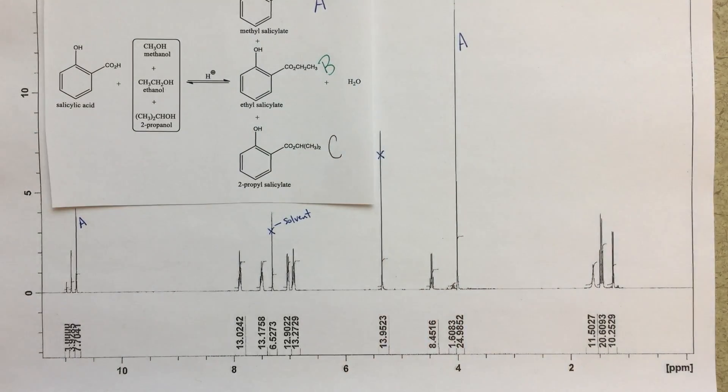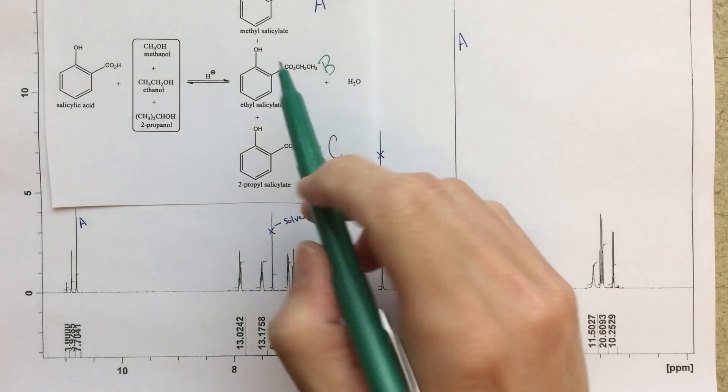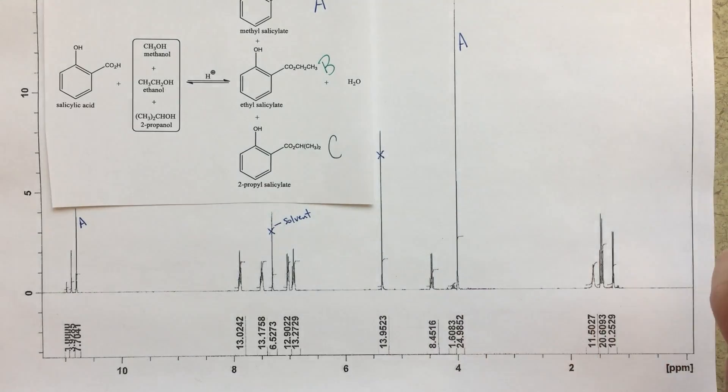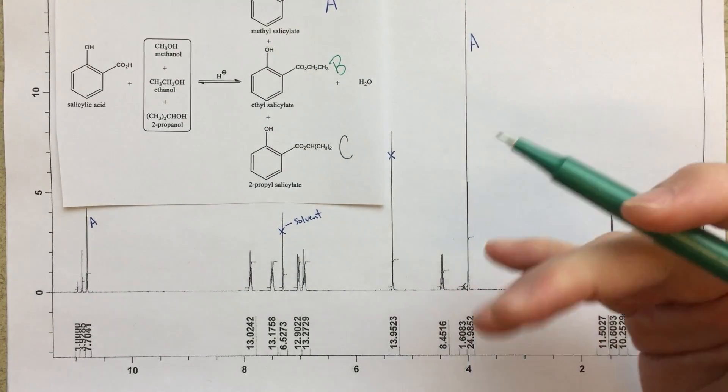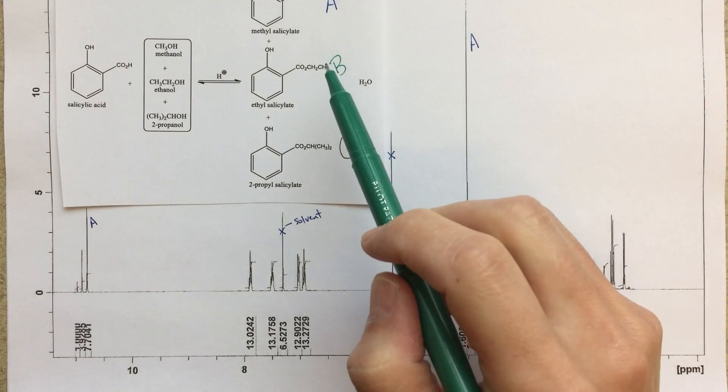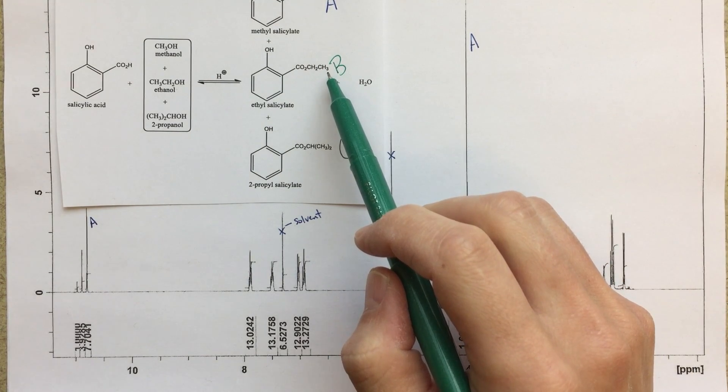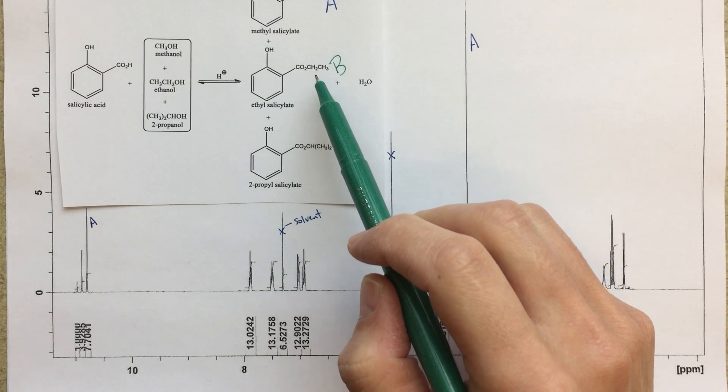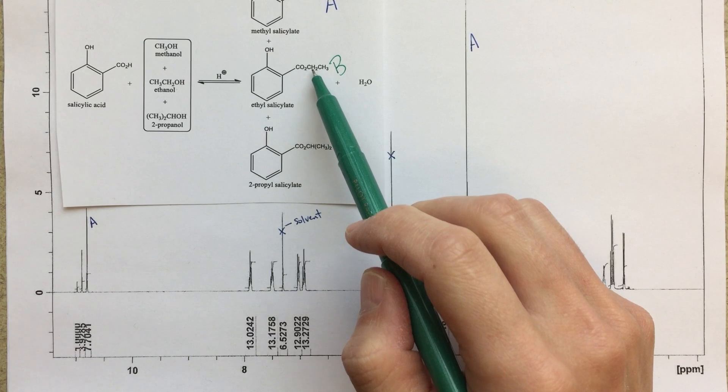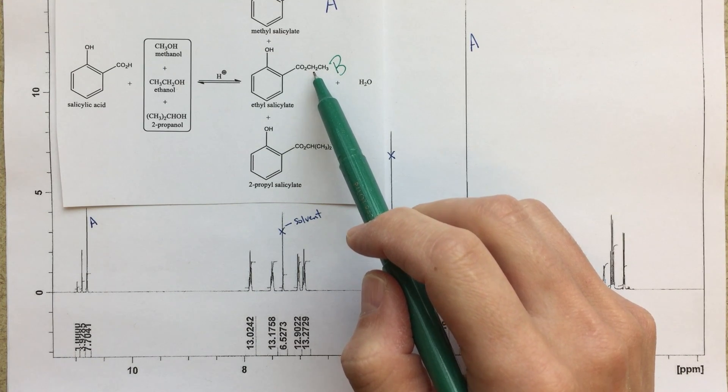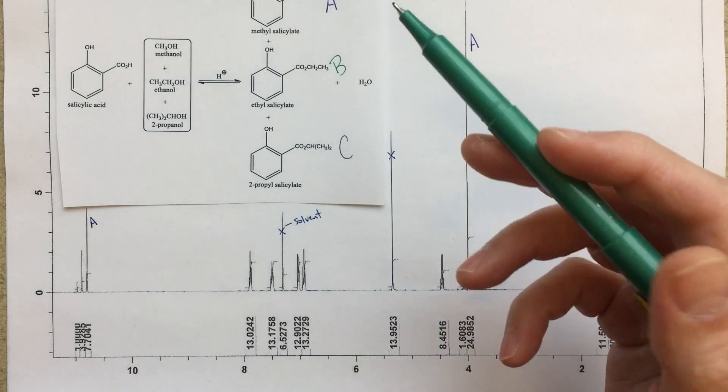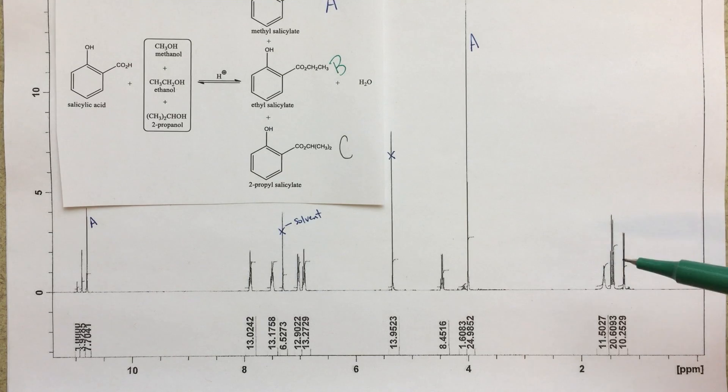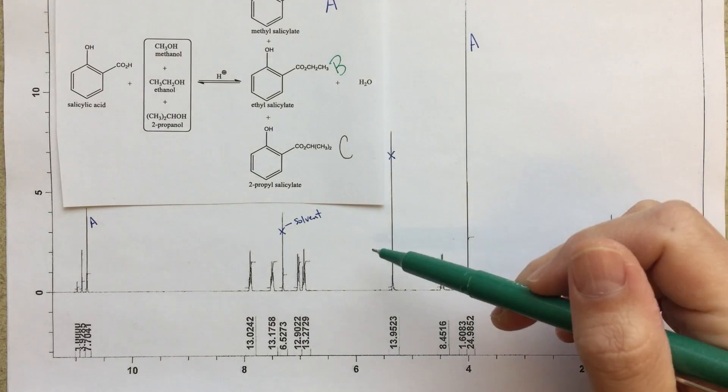So let's move to B then. So for B, I should have an ethyl group, so CH2-CH3. And if you remember in some previous videos, we talked about ethyl groups and how we have a very common motif for ethyl groups. This methyl group at the end should integrate to a three-high triplet because it's being split by the CH2, the methylene linker. The CH2, it should split into a two-high quartet.